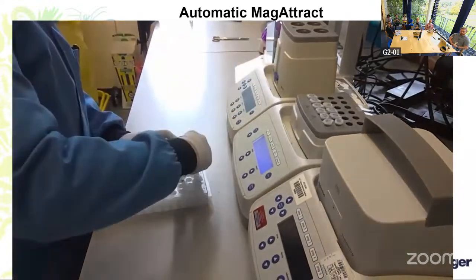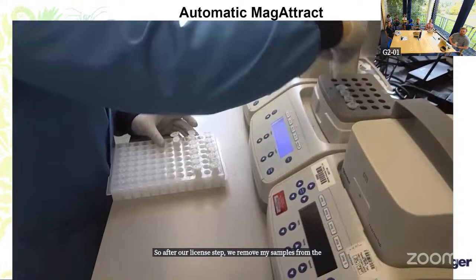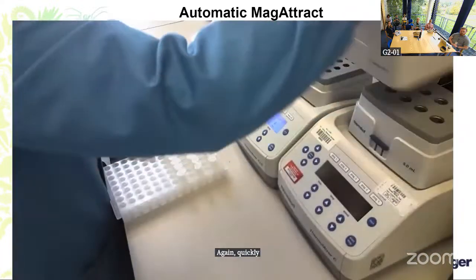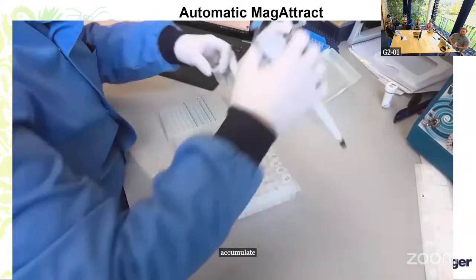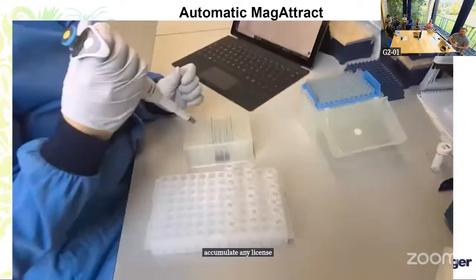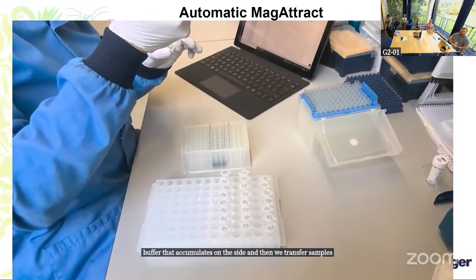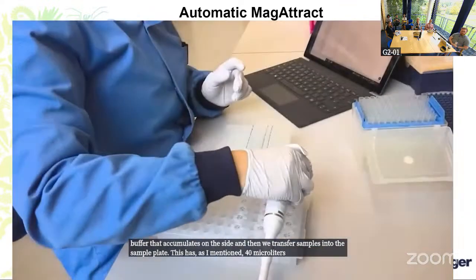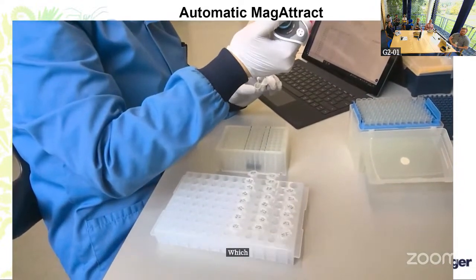So after our lysis step, we remove our samples from the heat block. Again, quickly centrifuge the samples down to accumulate any lysis buffer that's accumulated on the side, and then we transfer samples into the sample plate. This has, as I mentioned, 40 microliters of magnetic beads and a binding buffer, which helps the DNA bind to the magnetic beads.